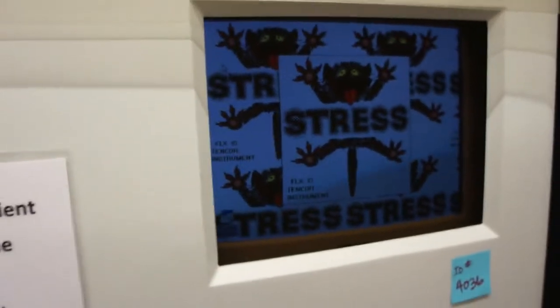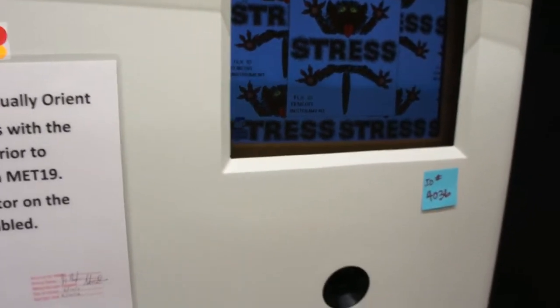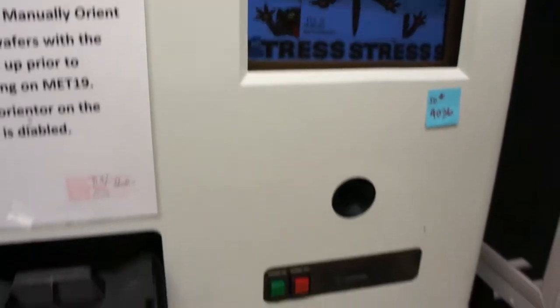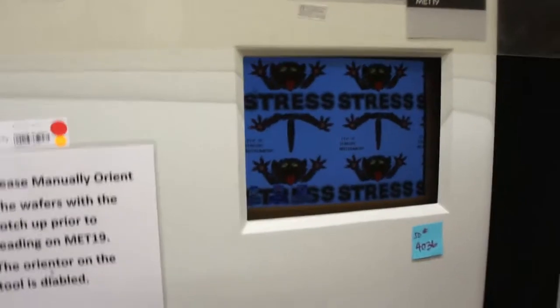Again, this is just to demonstrate the 8 inch capability, 8 inch operation of this tool.